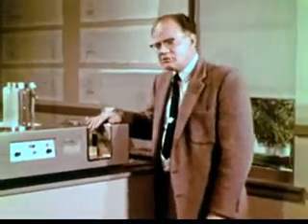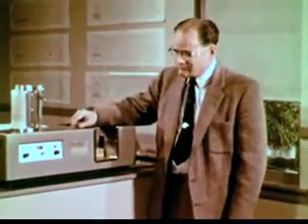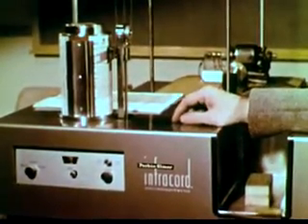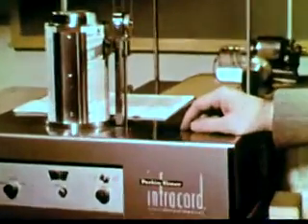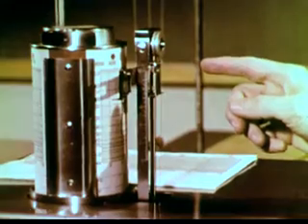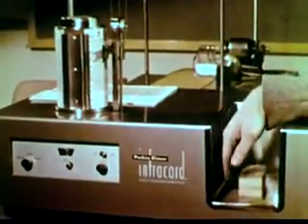Here, we have a spectrometer which scans the infrared spectrum and draws a graph of the transmission of the sample in the infrared. In this spectrometer, the instrument runs through frequencies in the infrared range, around 10^13 cycles per second. The top of the chart corresponds to 100% transmission, the bottom to 0 transmission.